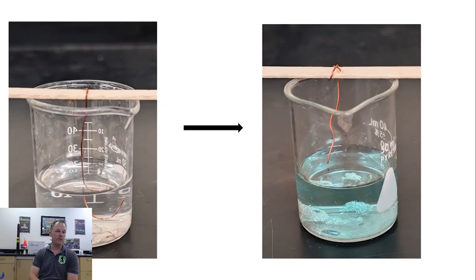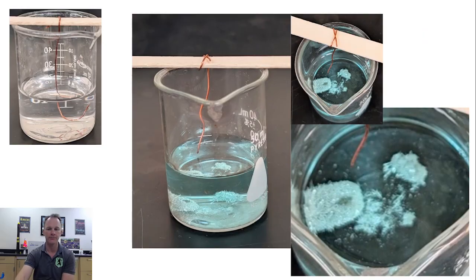And they grew and grew and grew, and hopefully over time you saw that they grew larger. And over time you probably also noticed that the water turned kind of a blue color. Why do you think that is? Is that evidence of a chemical change or a physical change?